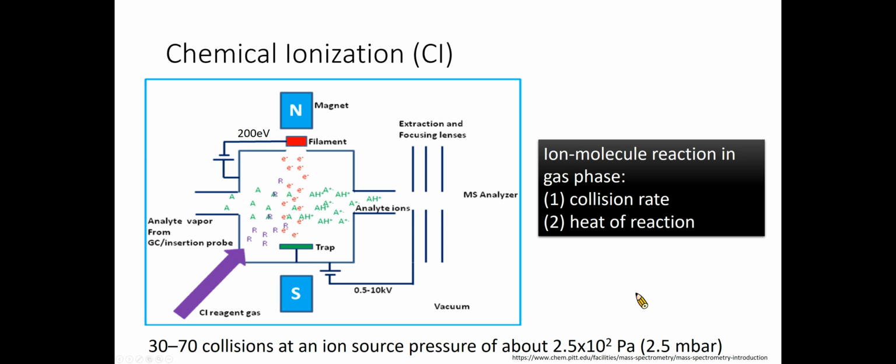Chemical ionization is based on ion-molecule reactions, which may involve the transfer of an electron, proton, or other ions between the neutral analyte M and the reagent ions generated from the reagent gas. CI generates analyte ions via bimolecular processes requiring a sufficiently large number of ion molecule collisions during the dwell time of the reactants in the ion source.